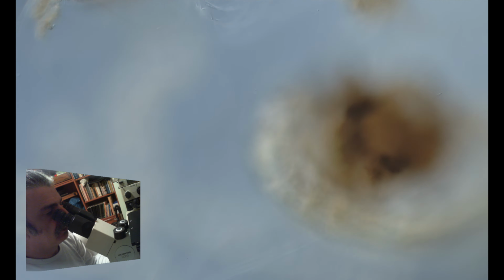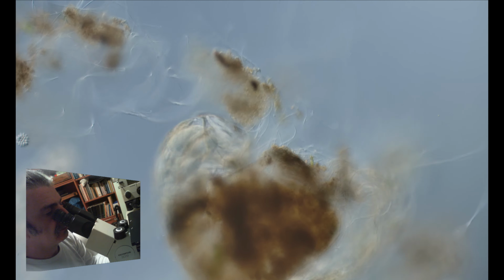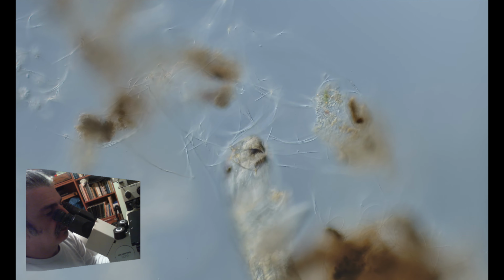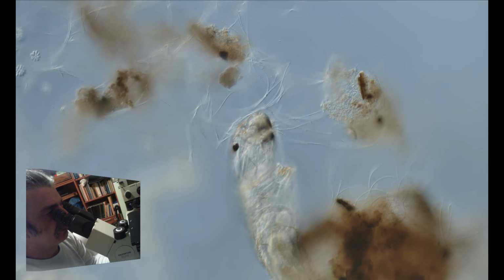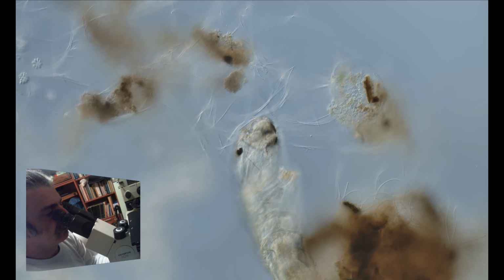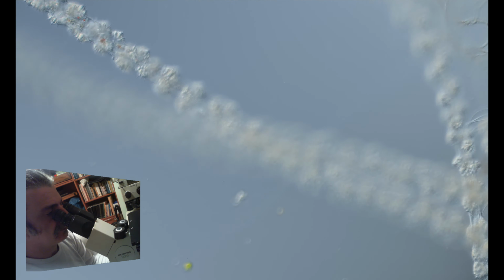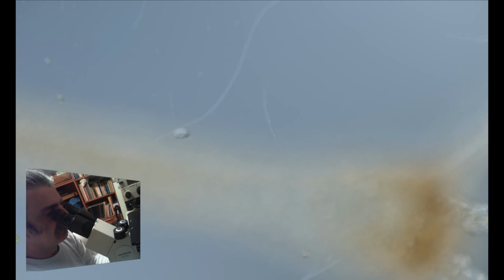But back to where it came from, we can see a mosquito larva. I think it's midge larva. Tentacles of hydra. Let's go back to the bottom.